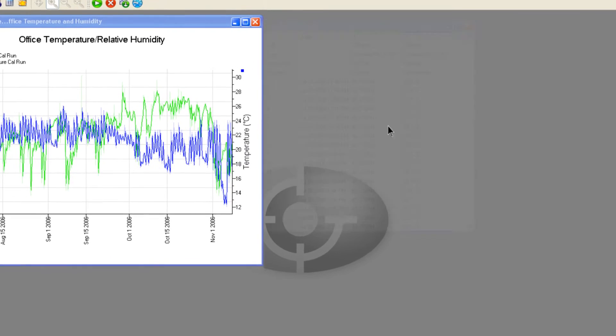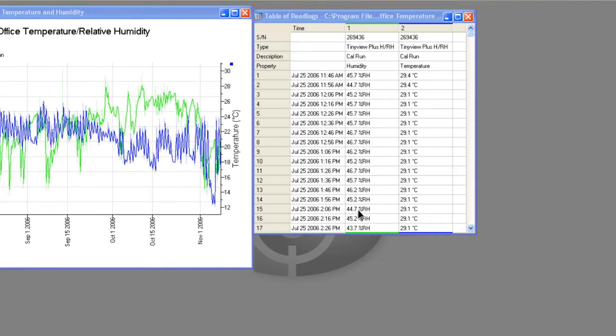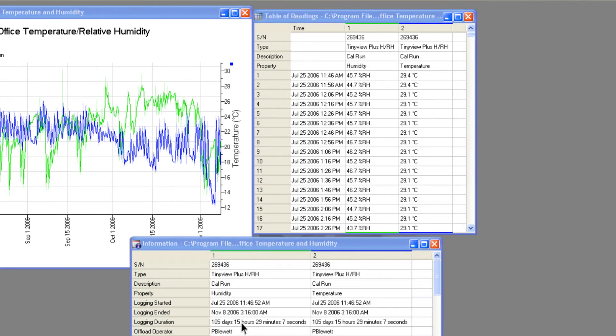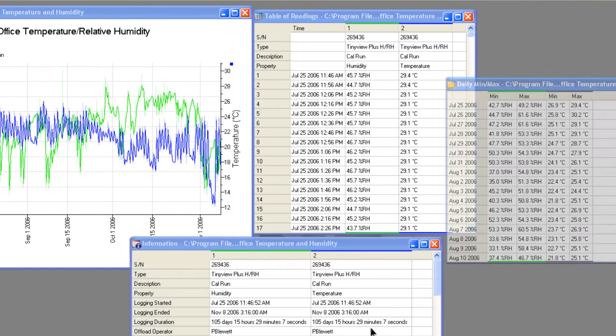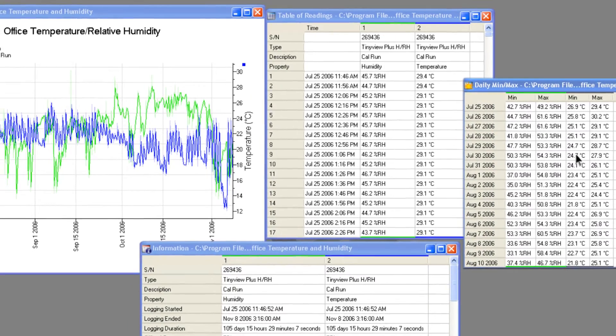Data can also be displayed as a table of readings, as summary information, and as a table of daily minimum and maximum readings.